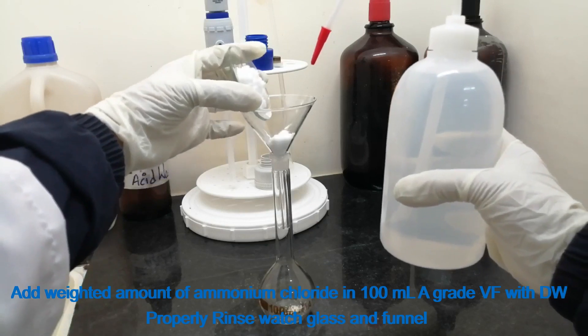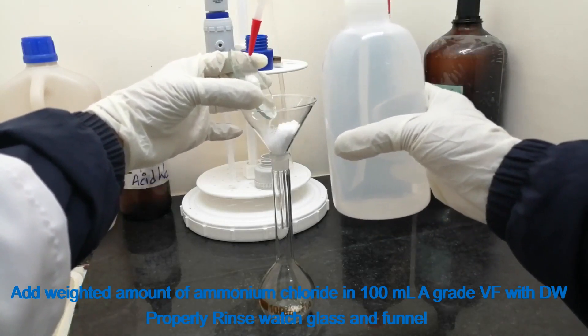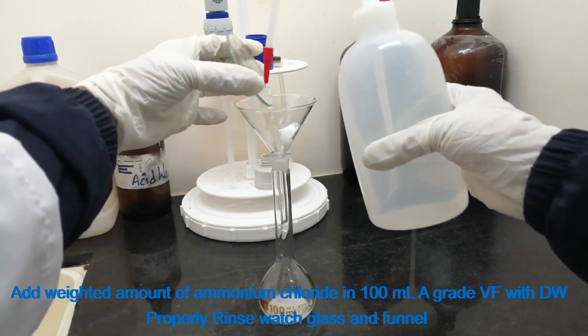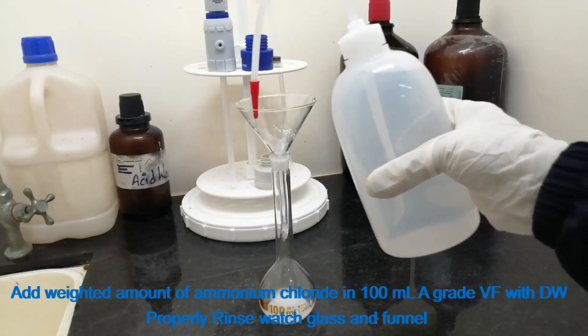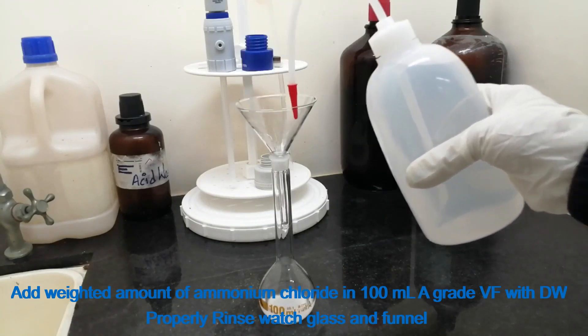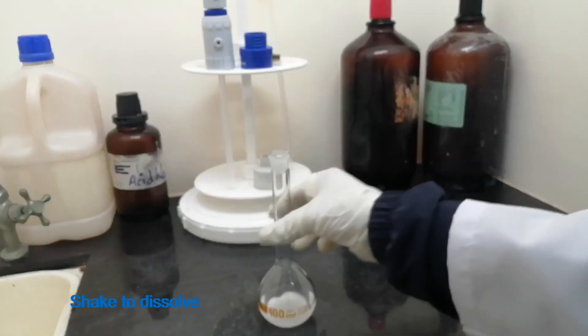Add the weighed amount of ammonium chloride into a 100 ml A-grade volumetric flask with distilled water. Properly rinse the watch glass and funnel. Shake to dissolve.